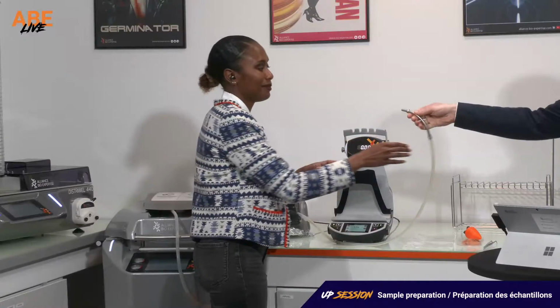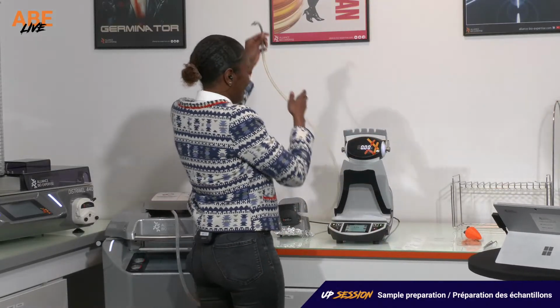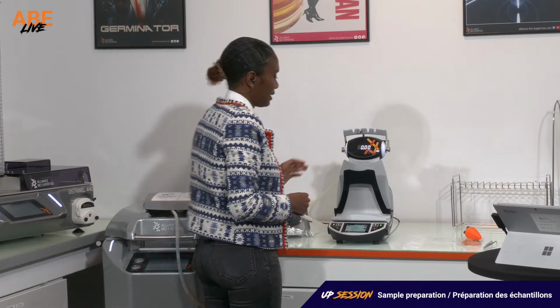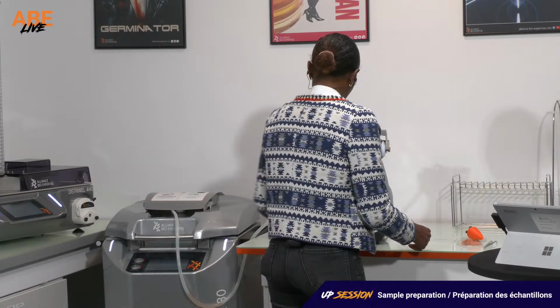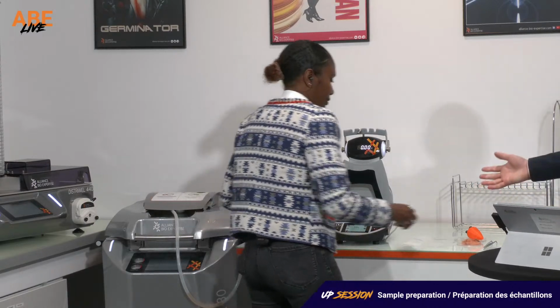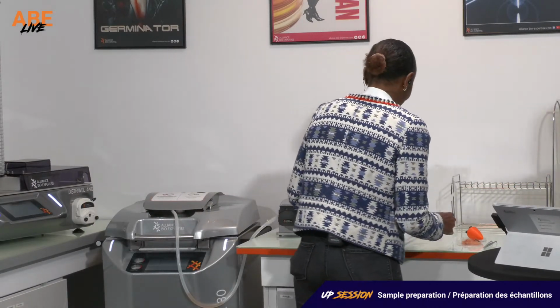Yeah. Can I take it back? Yeah, sure. Okay. So I just need to put it on my nozzle holder, right here. And I'm ready to begin my dilution.